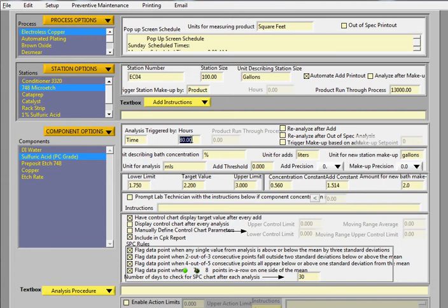Again, that's where you set up your production schedule with the days in the week and the start times for your process. So that 80 hours will just be strict production time that your process is actually running product. You have the option here to analyze after the add, just to double check that you've done the add, or that the technician's done the add correctly.